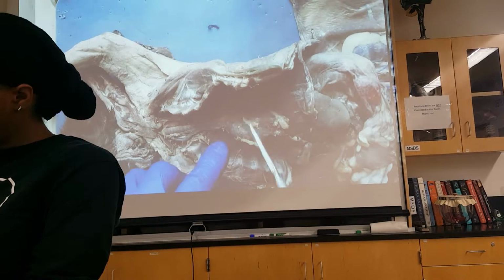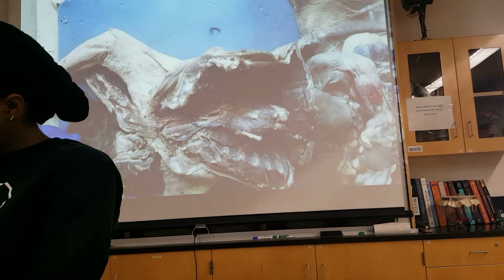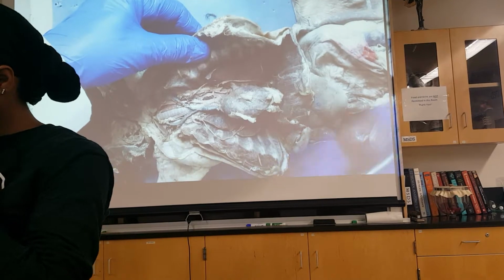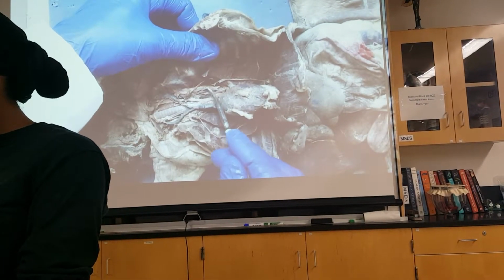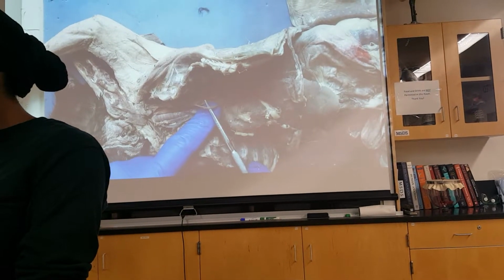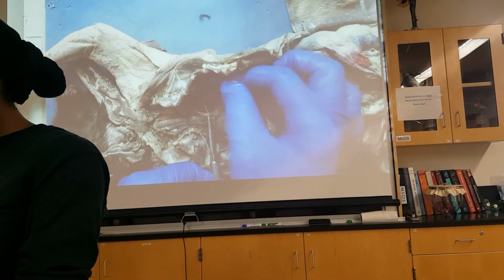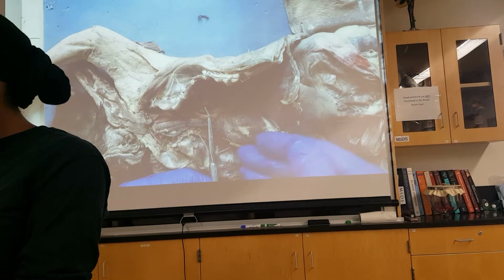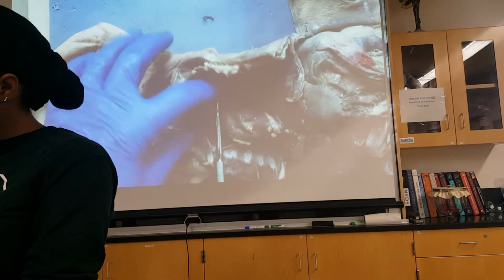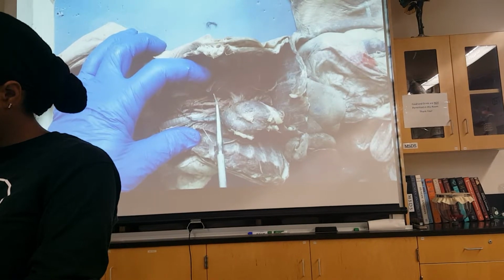The third pair of nerves then are the vagus nerves. These are running all the way to the abdominal cavity from the brain. These are cranial nerves, run all the way down here and allow the brain to control digestive activities. And the left vagus is right here, crossing the aortic arch. It looks short compared to the phrenic, but it's not. It's just the fact that it runs here and then goes under the aortic arch to the esophagus and follows the esophagus to the digestive system. So we just lose sight of it here, but it's actually much longer than even the phrenic.